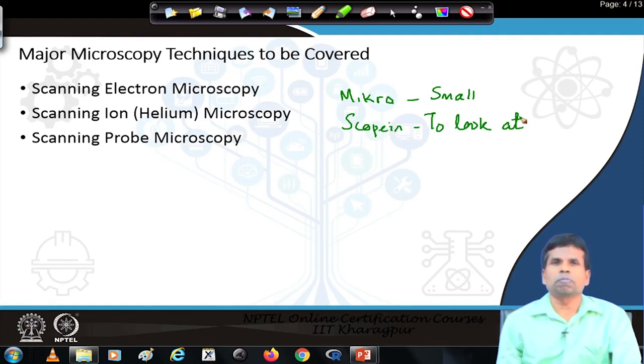However, as you know, light has a wavelength in the range of 400 nanometer to 700 nanometer. So, if an object is of size smaller than that, then this visible light will not be enough to see an object of size less than the wavelength of the light. And there come the electrons to rescue us.